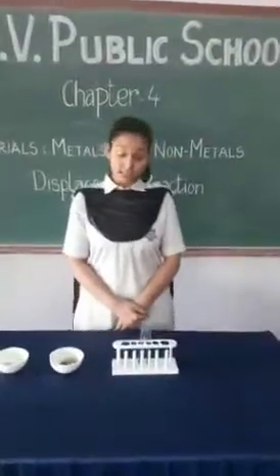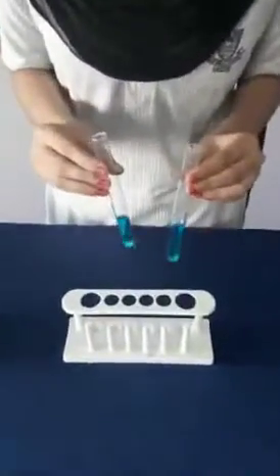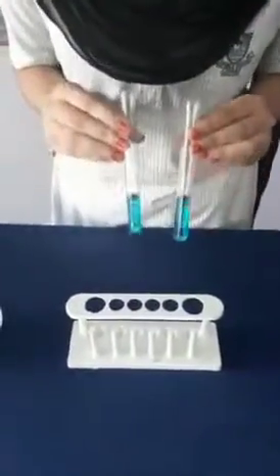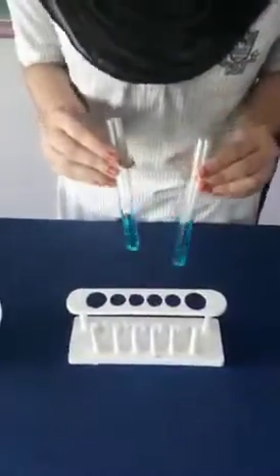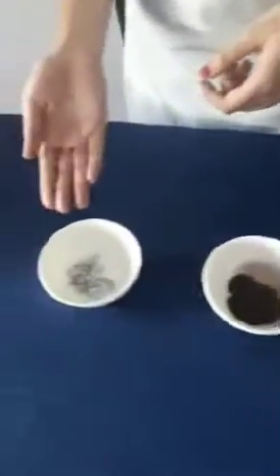For this we need freshly prepared copper sulphate solution in two test tubes, iron and zinc.